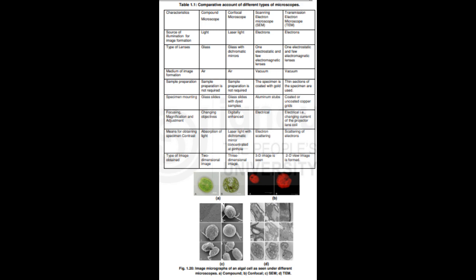The pressure-limiting apertures separate the vacuum region from the sample chamber. The specimen is placed in a relatively high-pressure chamber and the electron optical column is differentially pumped to keep vacuum adequately low at the site where the electron beam is exposed.